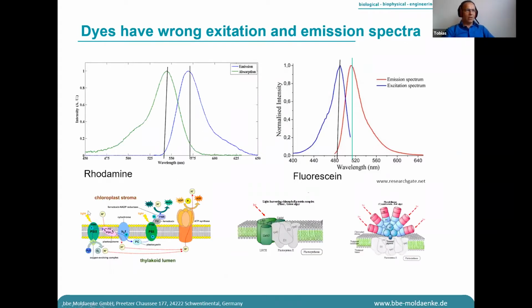And the reason for that is that you have a very complex system in the cell membranes. For example, here you have chloroplasma, you get different areas where the light gets absorbed, and you have also some pigments like phycoerythrin and phycocyanin, which are from the blue-green algae. And that's the reason calibration with the real algae is the best option for good data quality. That is what I wanted to tell you about that.